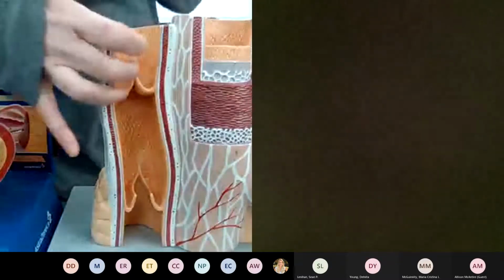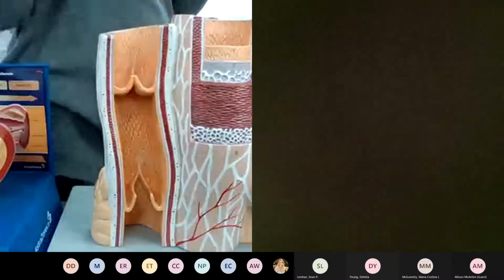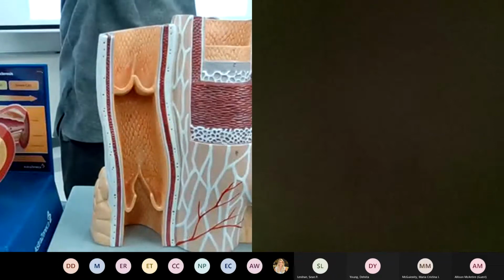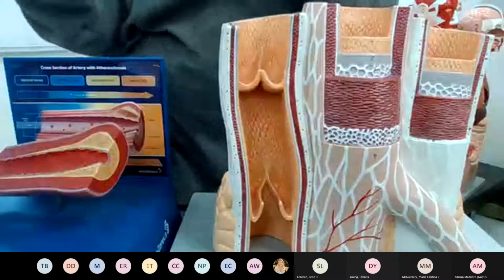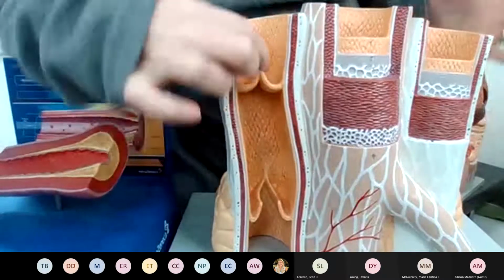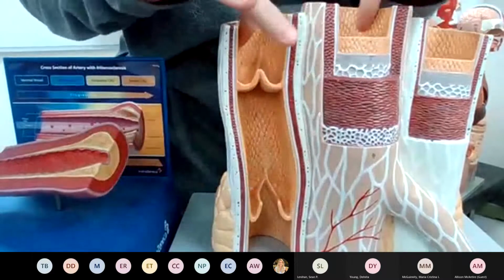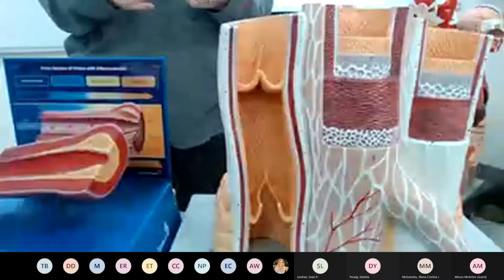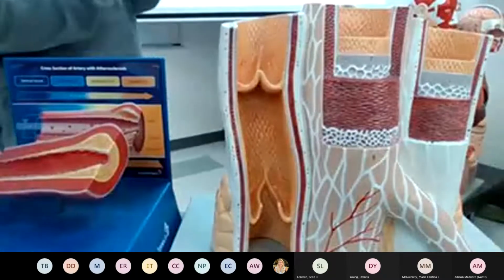These are also tissues that can communicate to each other and try to grow and multiply until they touch again during the process of the clot going away. In this image, I think this is number 7, this orange cell-looking layer is your tunica intima's innermost cells, your simple squamous epithelium or endothelial cells.